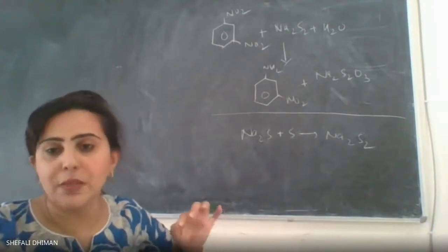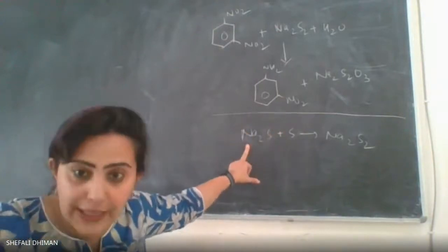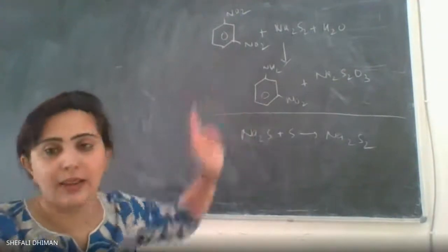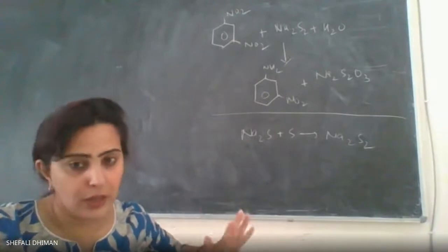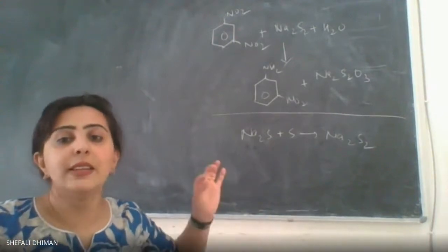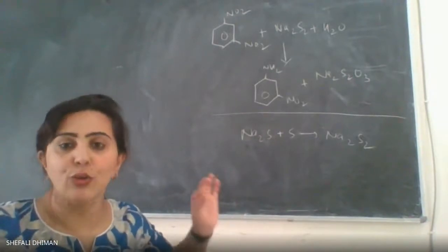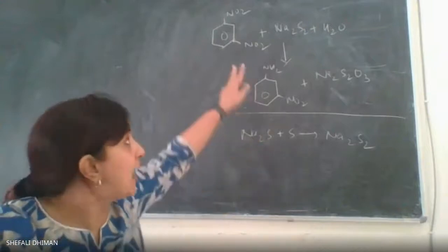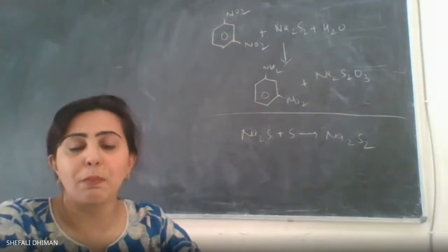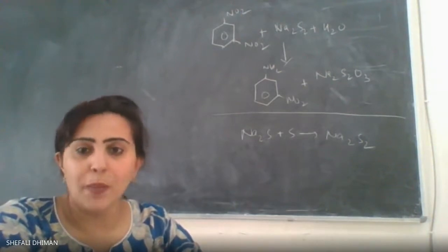This is an example of a partial reduction reaction. We prepared an in-situ reducing agent — sodium disulfide — by adding sulfur to sodium sulfide, then added it dropwise to metadinitrobenzene dissolved in hot boiling water with constant boiling and stirring. Out of the two nitro groups, only one was reduced to give the yellow-colored product metanitroaniline. This illustrates the difference between complete and partial reduction reactions.